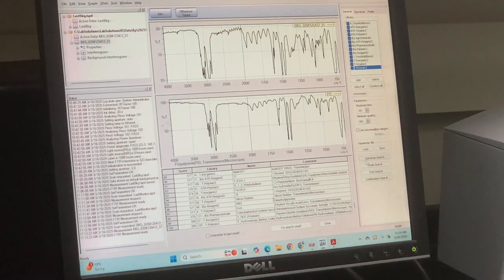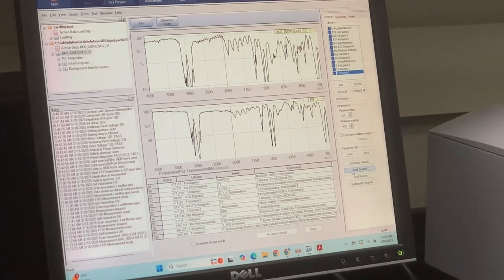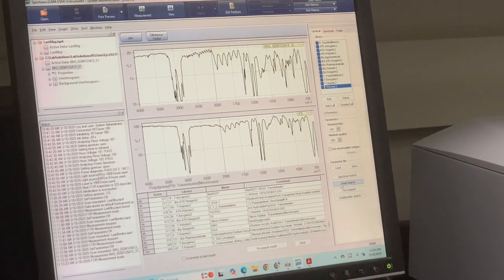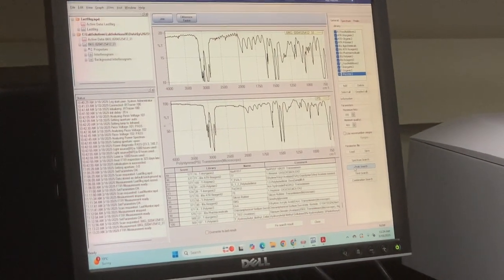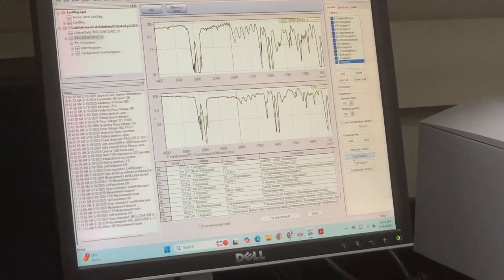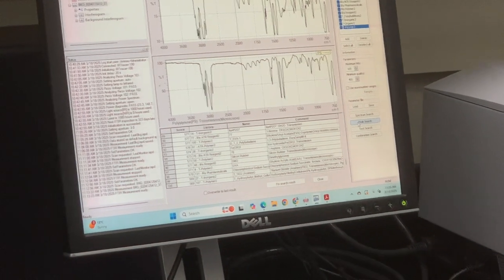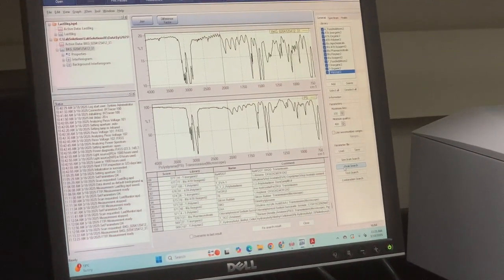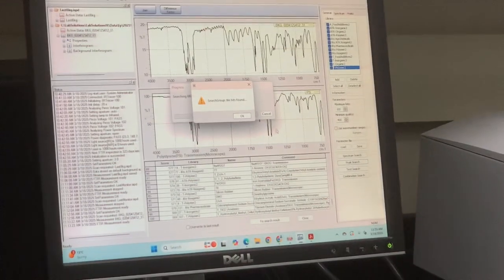Do you want to try putting that in? So you can also do peak search. If you don't want to do the full spectrum, you can. This is, I think, closer to what you were thinking. If you're just doing layers, this could work. But I was thinking when you were saying making an entirely new singular material that's half one layer and half the other layer, mixed together. It's a composite. If it was mixed uniformly, you could look for specific peaks. I guess you can do it either way.